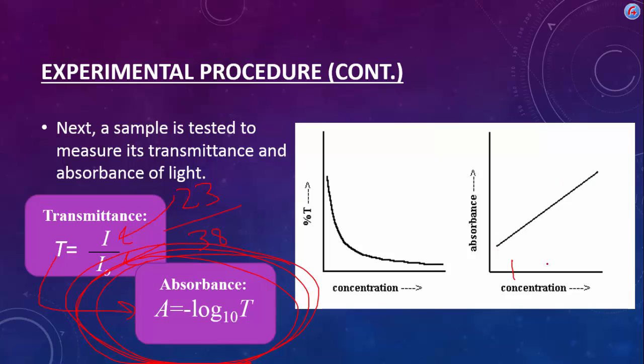As concentration increases, you plot out the absorbances and connect a line between all those, and you get that black line there. You have a nice linear relationship between absorbance and concentration. So later on, we can measure some unknown absorbance, go to our graph, and say, oh, this is the unknown concentration based on the absorbance we measured. That's what we'll be doing in upcoming labs.